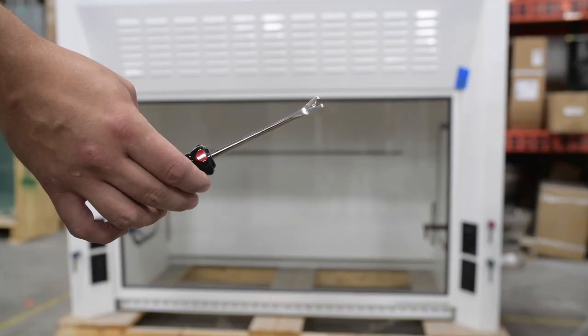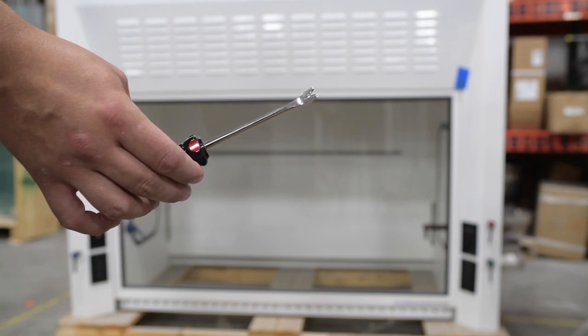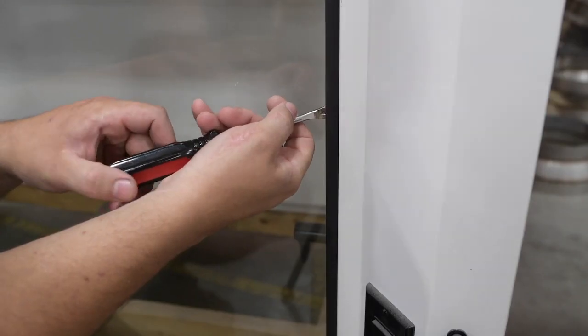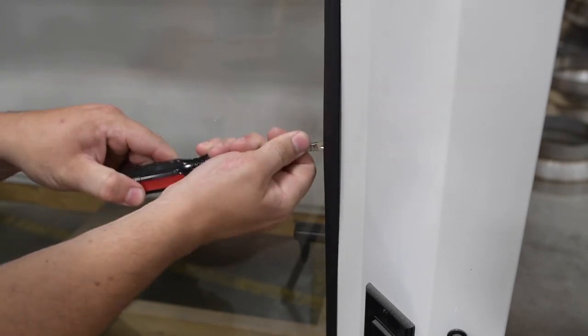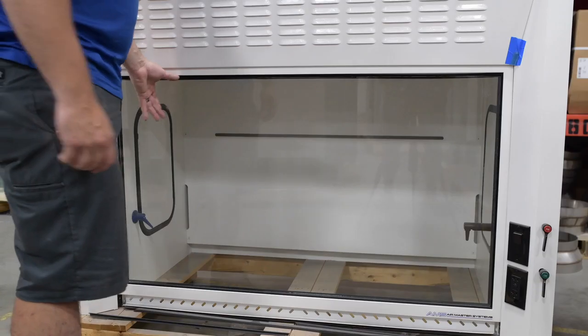Next, use a thin pry tool to get underneath the sash trim. Take your thin pry tool and start to work it between the sash glass and the sash trim with an outward pulling motion. You will see the trim will start to pop out. Go ahead and remove it on all the edges.